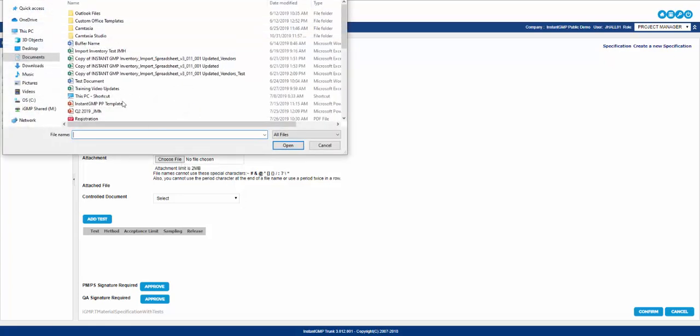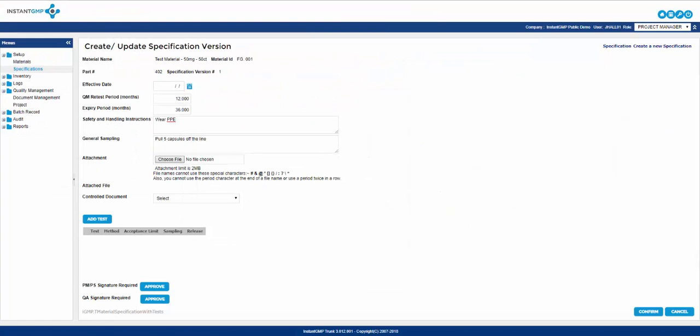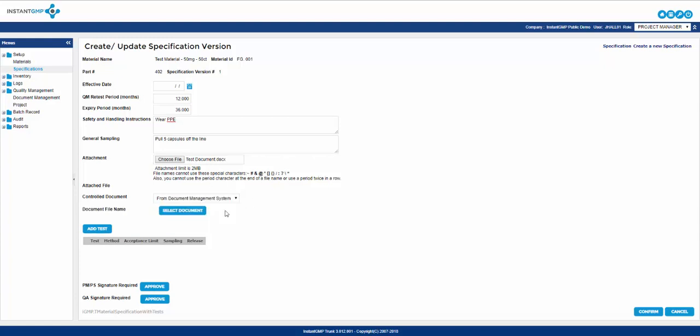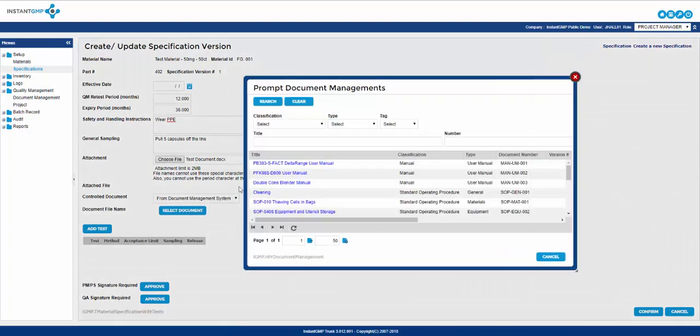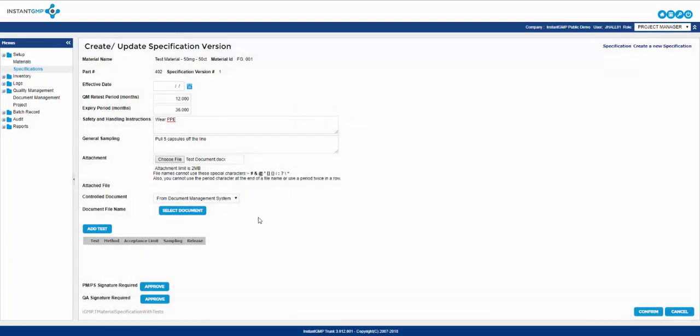The next section is attachment. Here you can add any document you wish to attach to the specification from your own computer. Below this is something similar with controlled document. This differs in one way because you can enter a URL from a website or choose a document that is already loaded into the software's document management system or DMS.